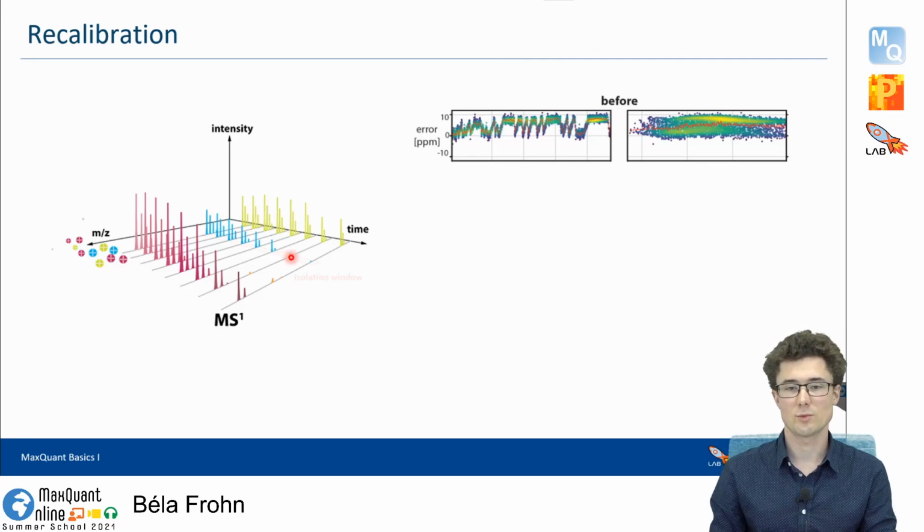So what we can do now is that we somehow stretch or smash together this two-dimensional plane in a nonlinear way, such that the spectra which we identified in our first search are actually at the correct position, and that they are in one line. So this will change our plane in a nonlinear way, but give us much nicer features, more like assembled in one line.